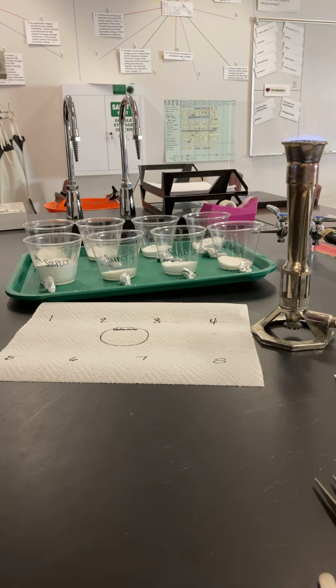So if we're just adding a little bit of heat and melting them for a couple quick seconds and they're able to change from a solid to a liquid that easily, then obviously that's a low melting point, versus a high melting point is one where we have a lot of energy that's needed to make that phase change occur. And again, you guys will see that on quite a few of these, that we're going to hold them in the flame for a couple seconds and there's going to be no change to them at all, except maybe a little bit of burning, but no melting.